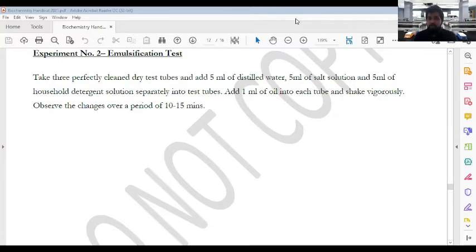As in the solubility test, you observe two layers. Yes, oil. What is the reason for that? Why does oil go to the top? Density of the oil is relatively less. Yes, as this is clearly answered, the density of oil is usually less than water, so it goes to the top.